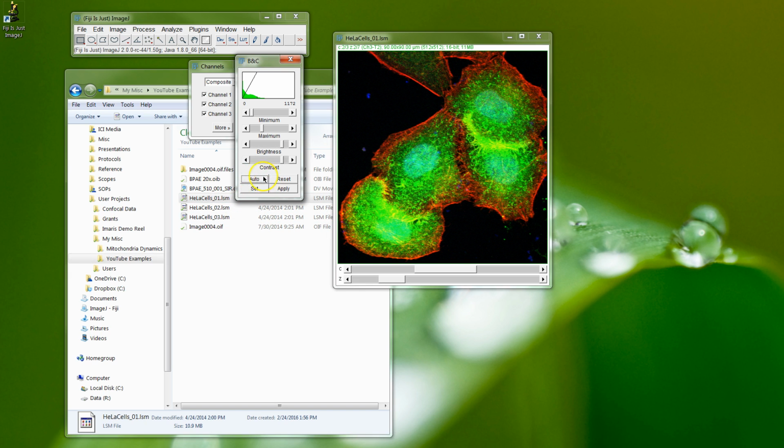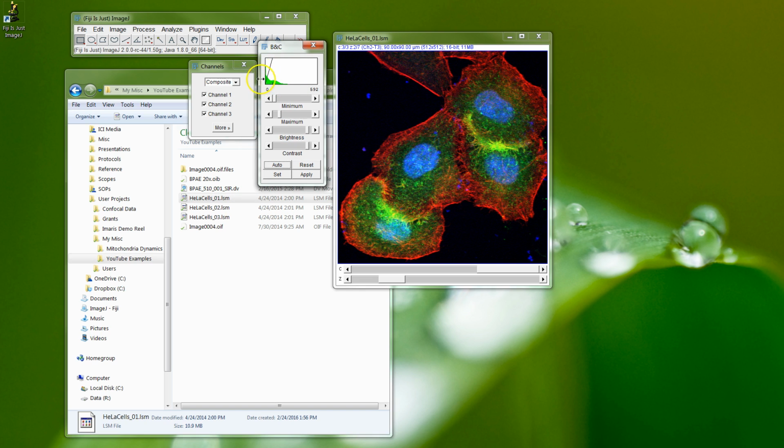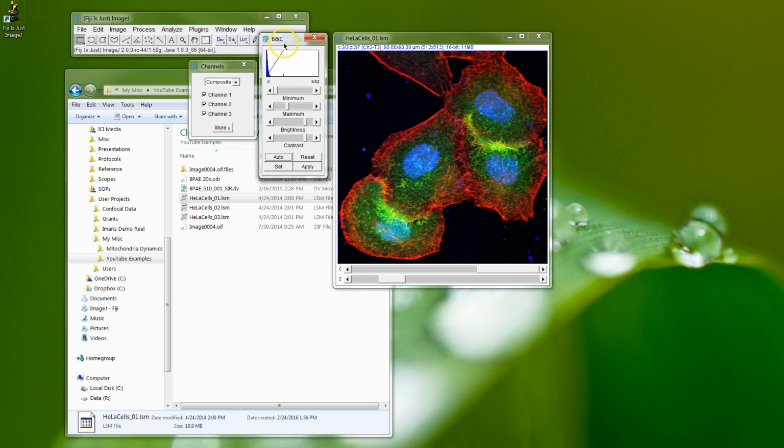and then you'll see a little dotted line here, and that is the control of that window. I can hit space to get that to activate, then mouse wheel, Control Shift and C, and then space again. It'll auto scale those as it goes. You'll notice that this didn't change on the last move, and sometimes it doesn't update and you need to click on the window and click back on it to get it to update, so that's something to watch out for. Catches me out a lot.